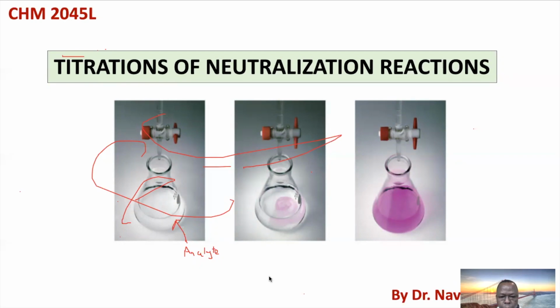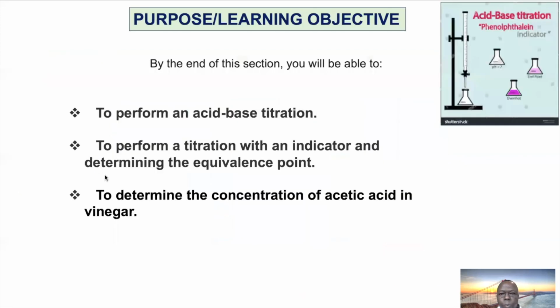You need to know the glassware we use in this titration technique. So the setup looks like this. We call this the burette stand. All right. Erlenmeyer flask, and there is the burette clamp here. And by the end of this, there are some terms you need to know.